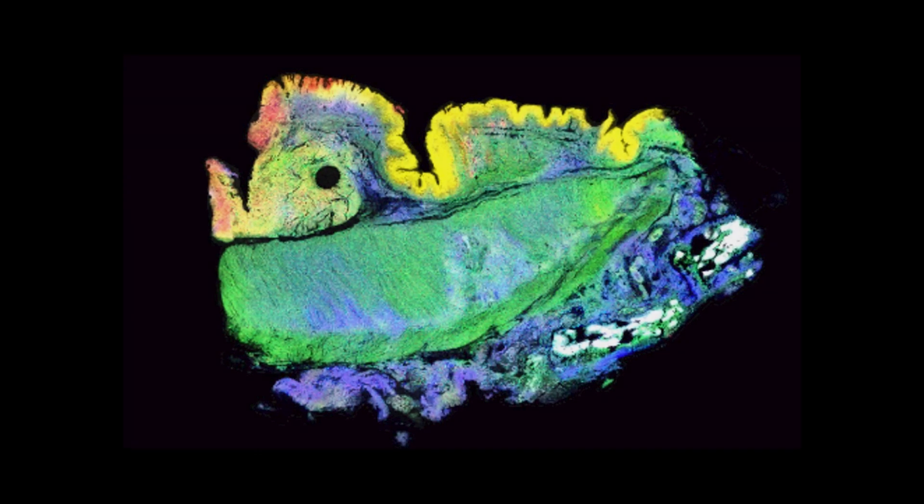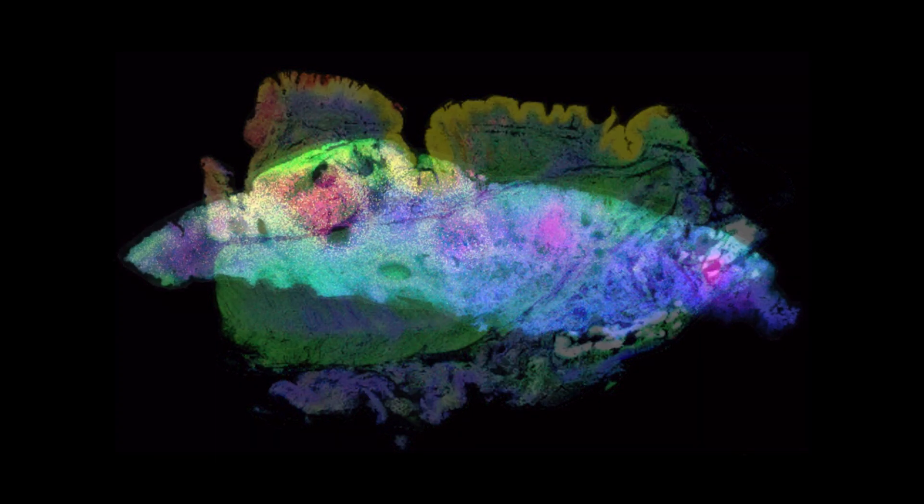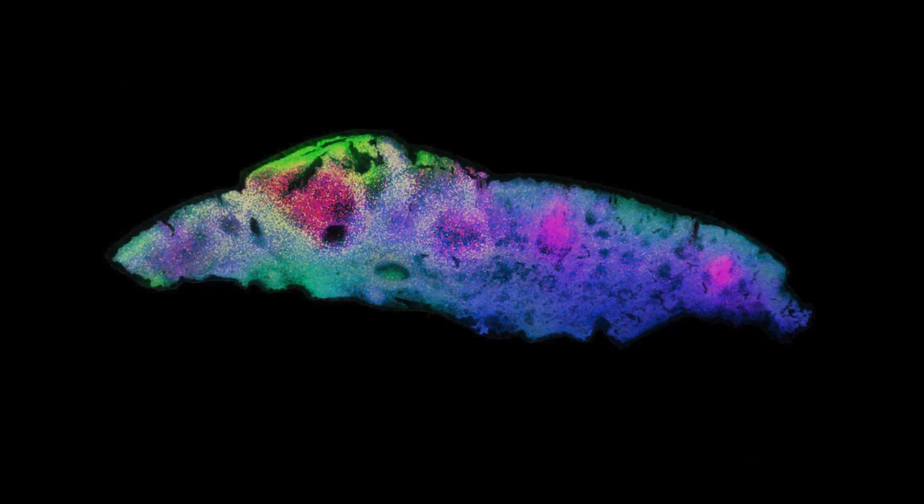We've also seen that in particular tumor subtypes, like if it's a mucinous tumor or a neuroendocrine tumor, there are very specific classes of glycan structures that are detected in these types of tumors.